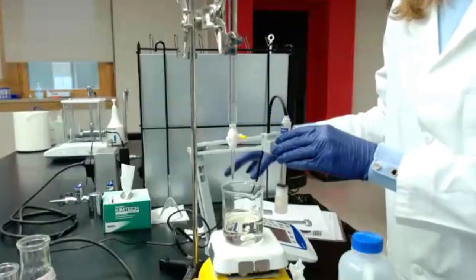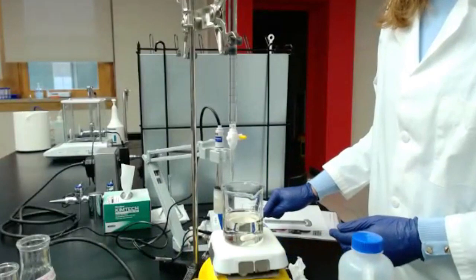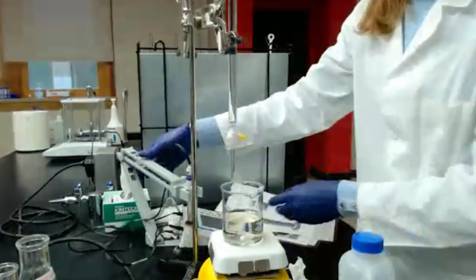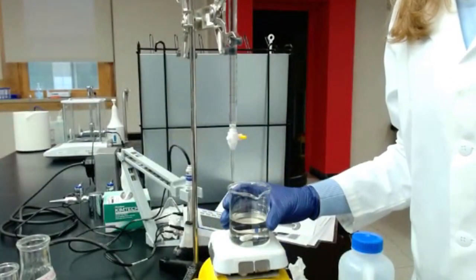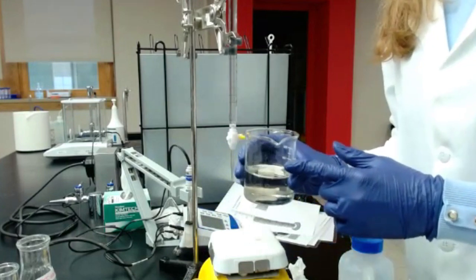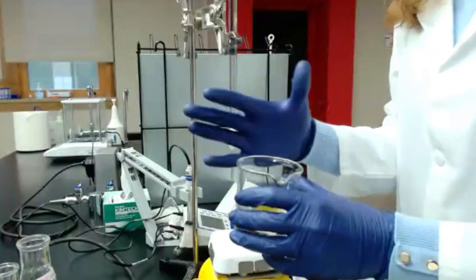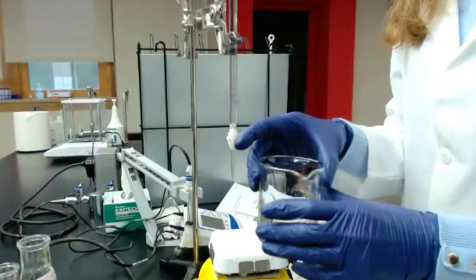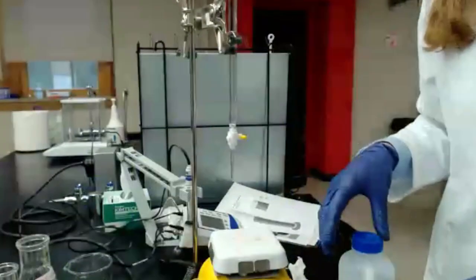All right, and so then you're done. You can turn off your pH meter. So based on the waste management discussion we explained, make sure you know what to do with your waste. You can use a waste container that is probably going to be picked up by someone, and I'm not sure how you do it in a winery or in your own space.